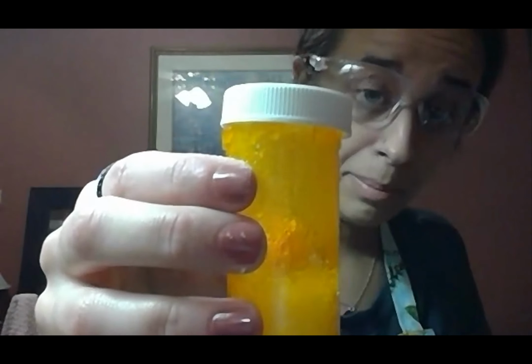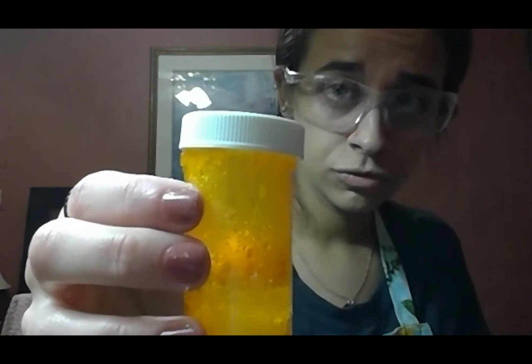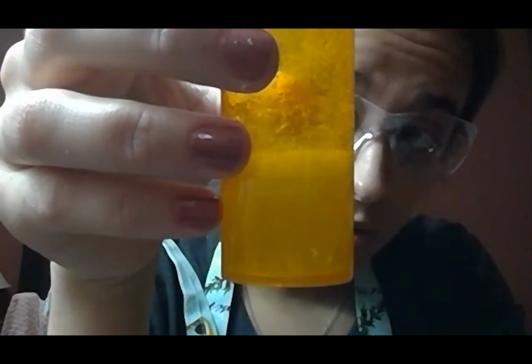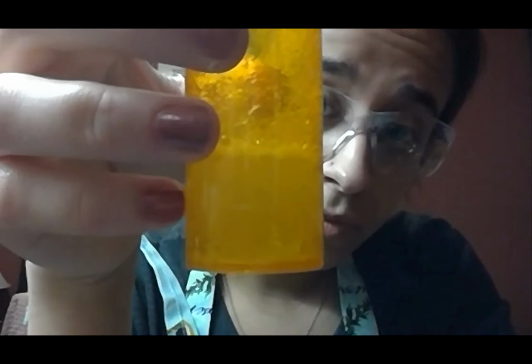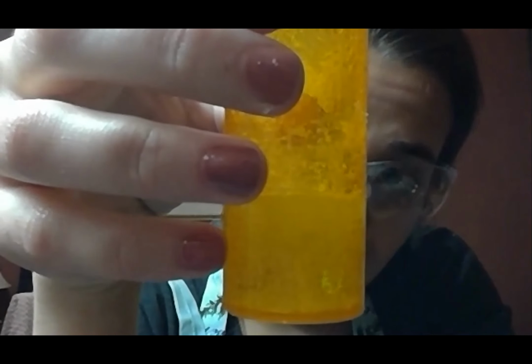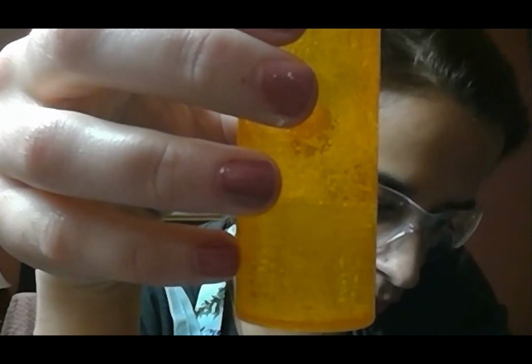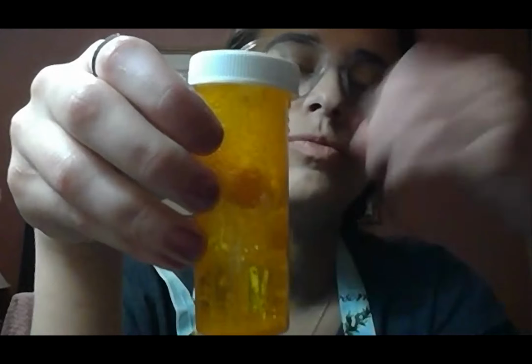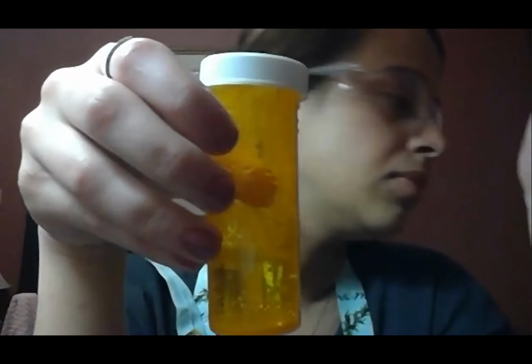You can see it's bubbling up more. So it's definitely increasing its rate of the reaction. It came up higher. It too must not have enough momentum or enough bubbling of the gas to blow off the top, but the reaction stopped a lot quicker than that other one. So let's say that that one was about 30 seconds. So that's what I have on my timer. So 30 seconds for part B.